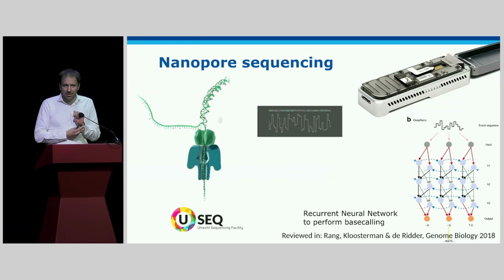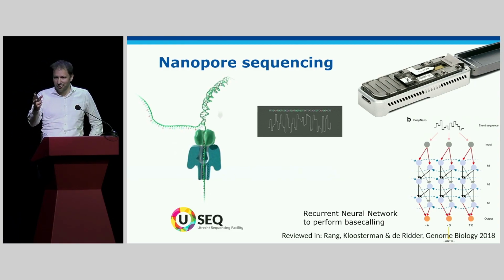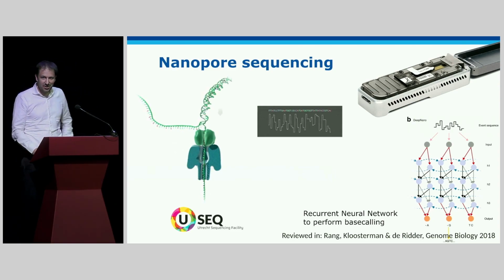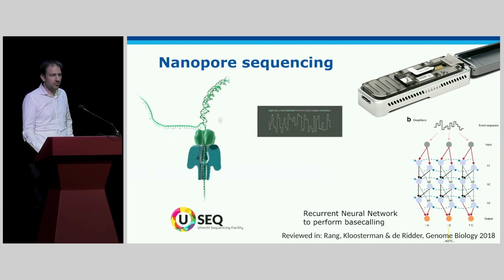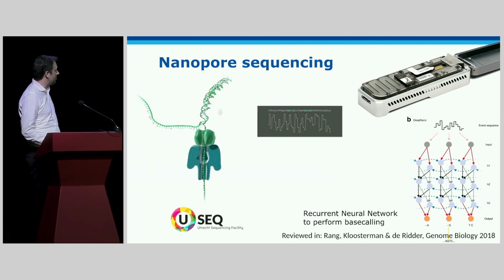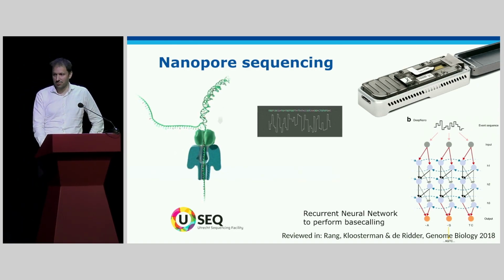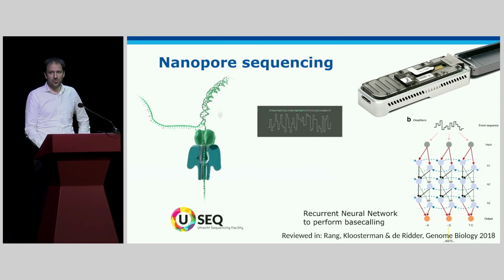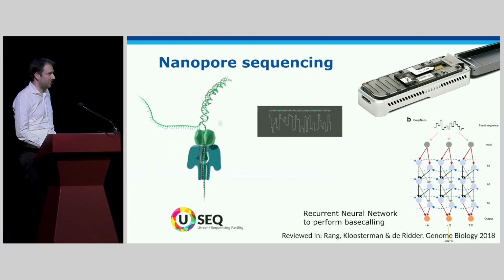So I'm not sure how many of you are familiar with nanopore sequencing. Frederike Koller from Nanopore is actually in the room, so any questions can also be directed to her. And Is Nijman, who was also mentioned before, is running the sequencing center at the UMC Utrecht, and that's where all these experiments have been done. By the way, USeq is one of the technology centers within the X-omics consortium, so you should definitely get in touch with Is or with me if you want to run nanopore sequencing yourself.